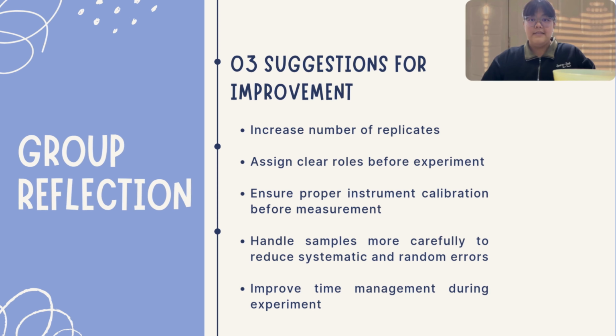Lastly, for improvements, we suggest increasing the number of replicates to enhance the reliability and reproducibility of the data. Assigning clearer roles within the group before starting the experiment could also improve workflow and reduce errors. Furthermore, taking extra care in instrument calibration and sample handling would help minimize systematic and random errors. Overall, this experiment not only strengthened our understanding of protein quantification using spectrophotometry, but also highlighted the importance of precision, teamwork, and critical thinking in obtaining accurate scientific results.